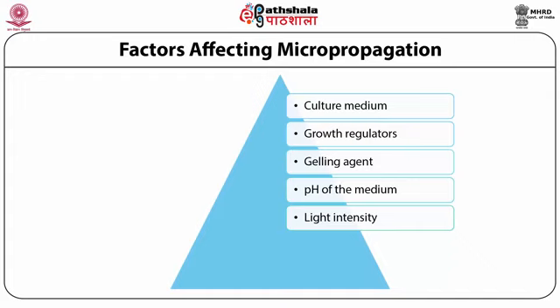At the same time, it's expensive. Electricity is a major cost in a tissue culture company. So therefore, you restrict use of light to a minimum. The other thing is that the lighting also induces heating. And therefore, it is advisable to switch on the lights during night when temperatures are comparatively lower. But maintain the photoperiod and the right light intensity.